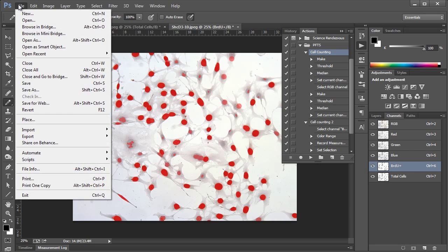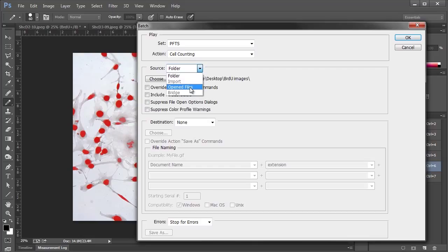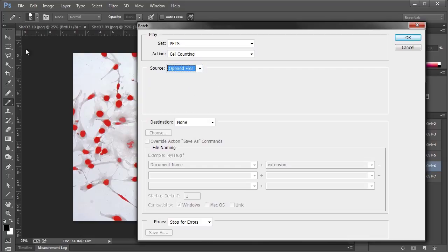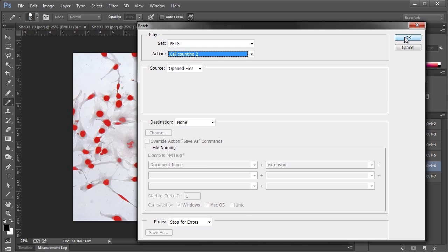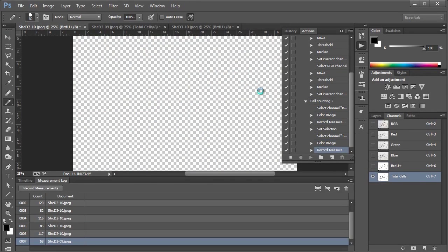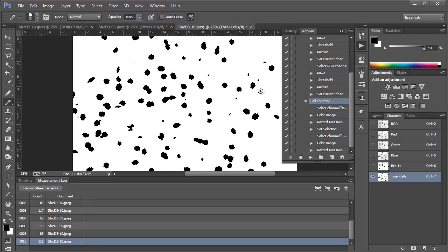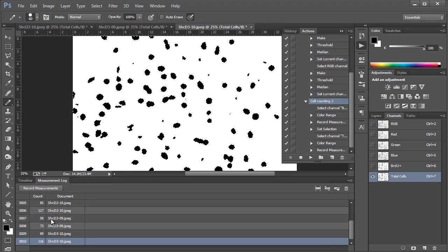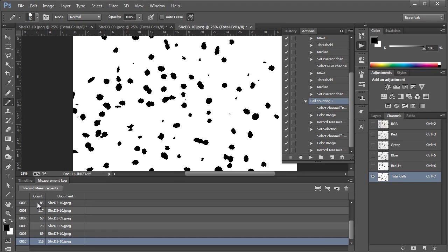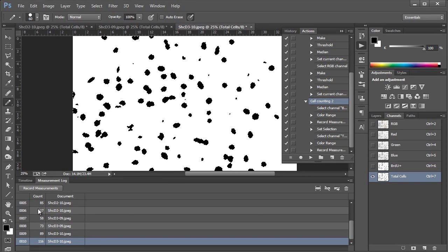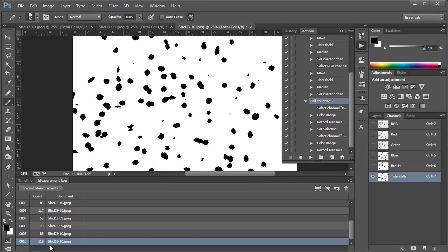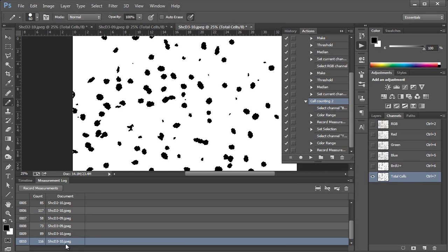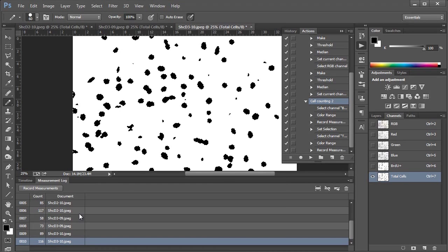So let's say now we're happy with all of our edits. What we can do is the second half, which is the counting. And all we need to do for this, we'll say automate batch. But this time, instead of a folder, what we're going to say is open files. And so that's going to take all of these files that are open along the top and run, which we want to remember, basically, the second half of our cell counting action here. So we'll choose cell counting two. And then we'll hit OK. And now we'll go through and perform all the counts. And you'll notice I'm just sitting here doing nothing while it does its job. And you'll see, yeah, for each individual file, there's BRDU and total. And like I said, you can export all of these out to Excel to do your further analysis. And you're off to the races.